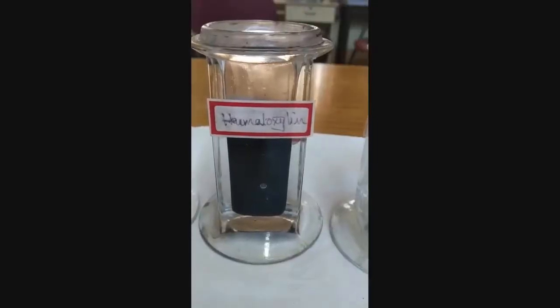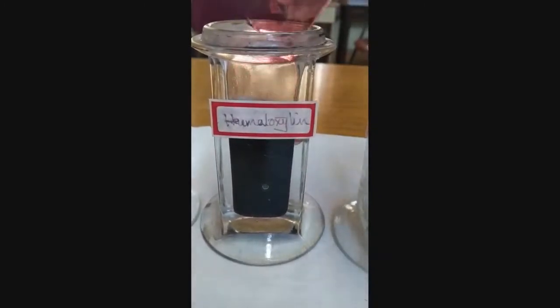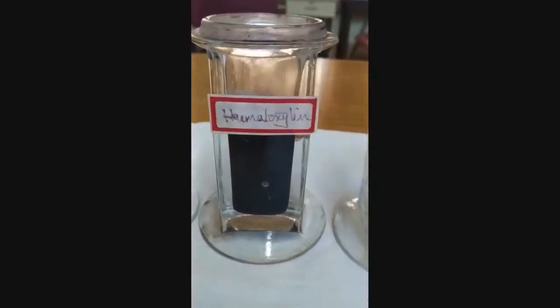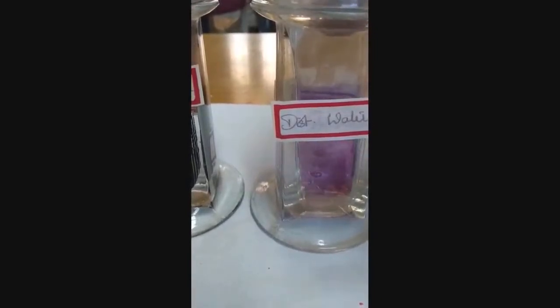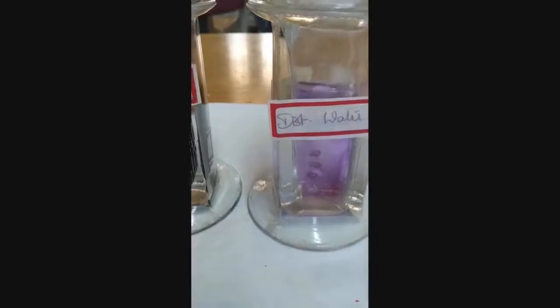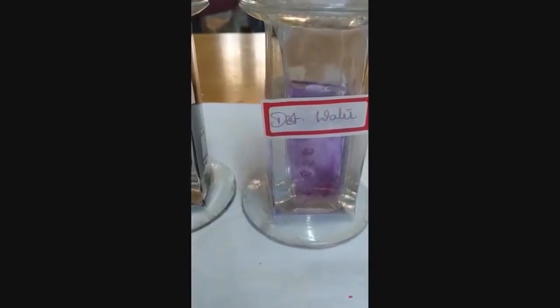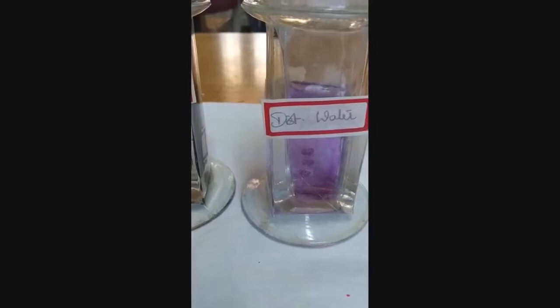After about 5 minutes, take out the slide. You can see the material that has stained. Dip it in distilled water. This will clean the slide. Do not pour water on the slide because the tissue can get washed in. You can leave it in water for about a minute.